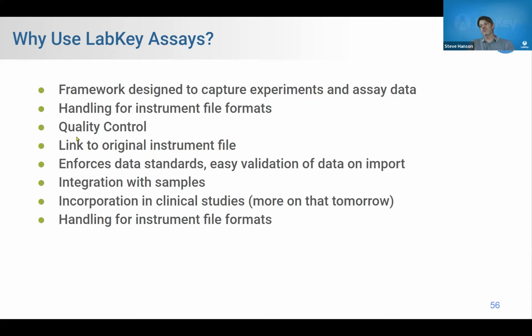This is a framework for importing and dealing with and managing assay data, experimental data. I mean, why wouldn't it be the most complex and built out part of the server? We do scientific research data. So naturally, the module that handles research data is pretty built out. So why use it? Well, it's a framework designed to capture your experiments and assay data.